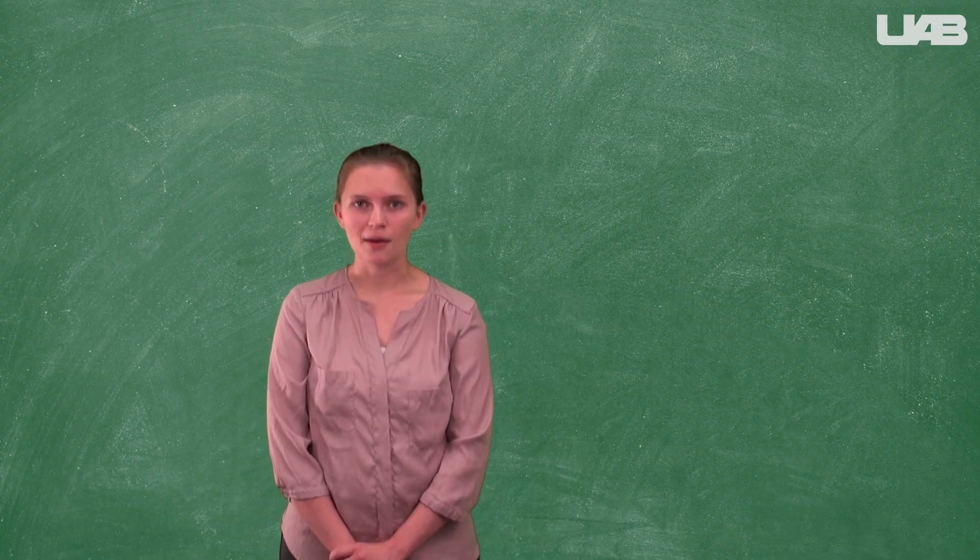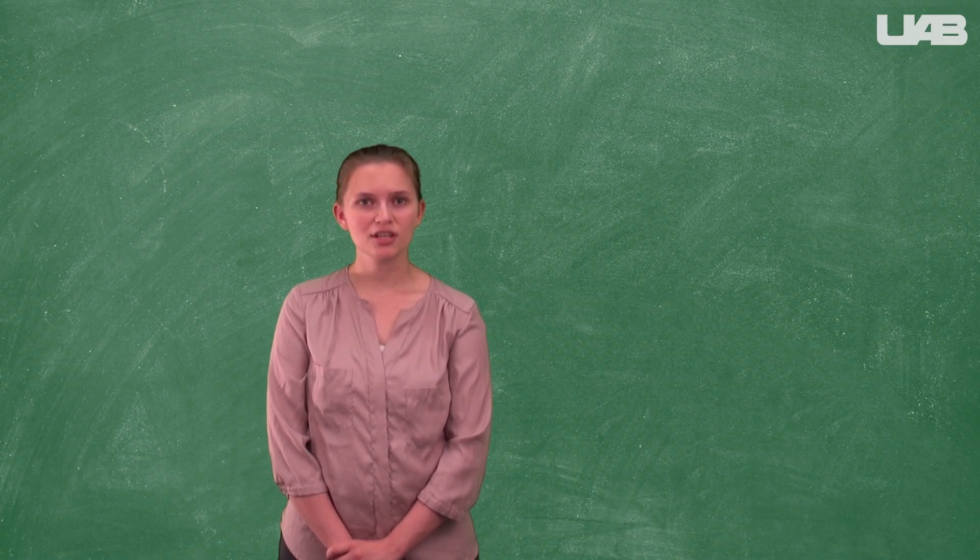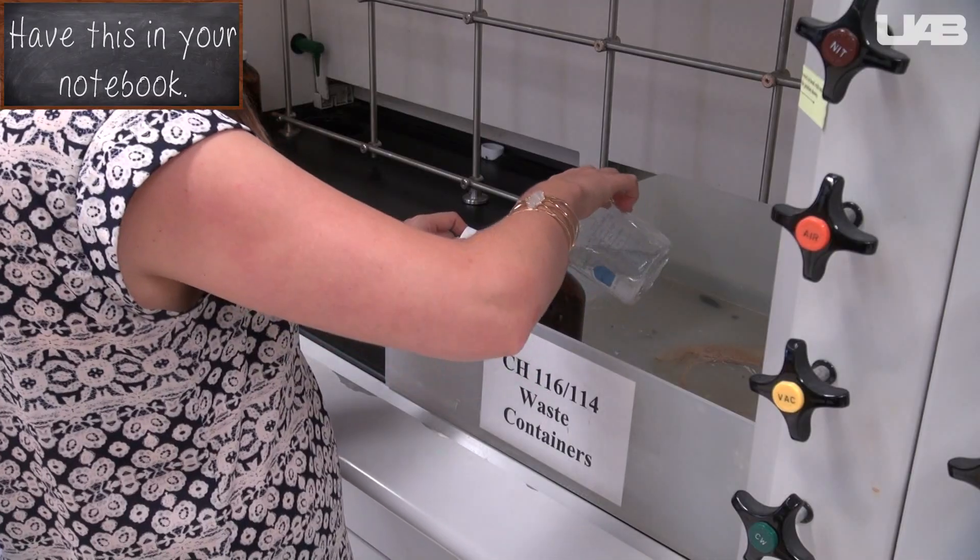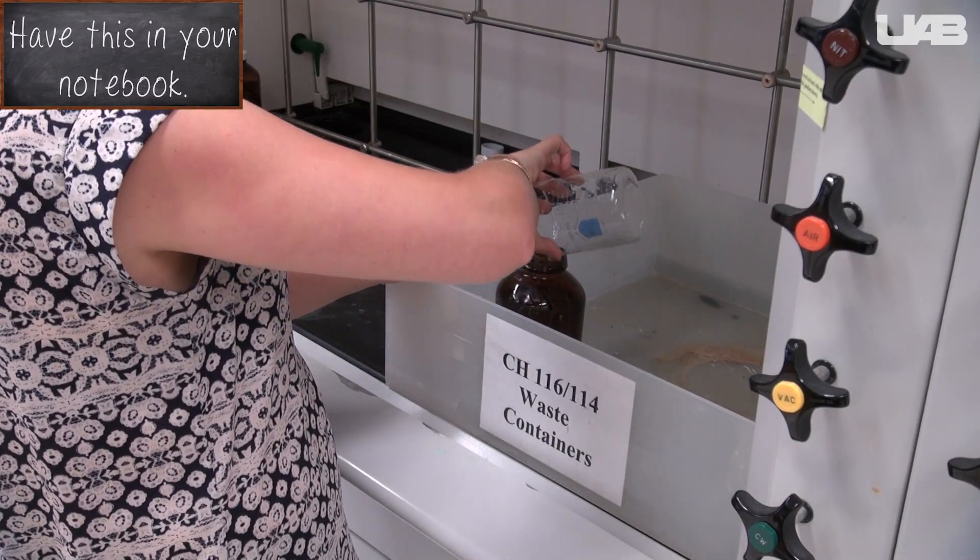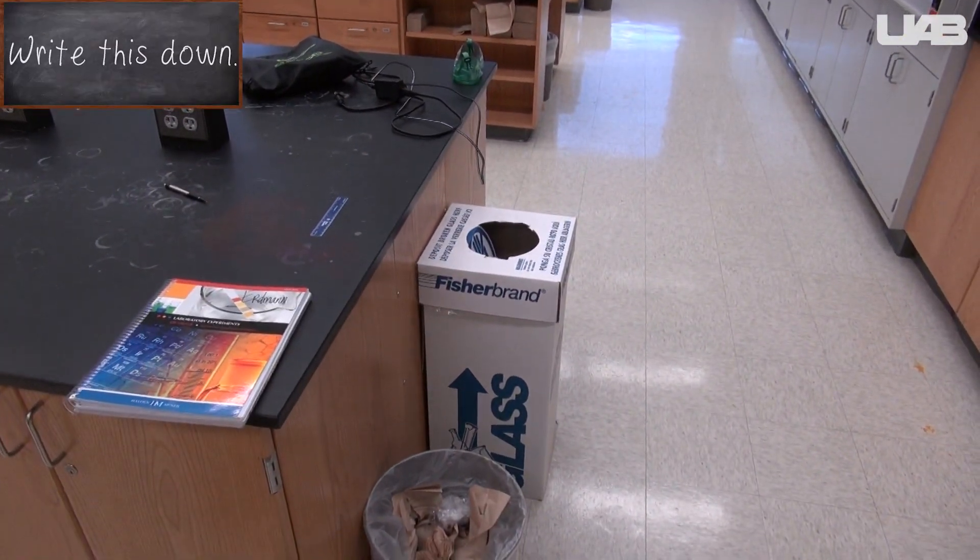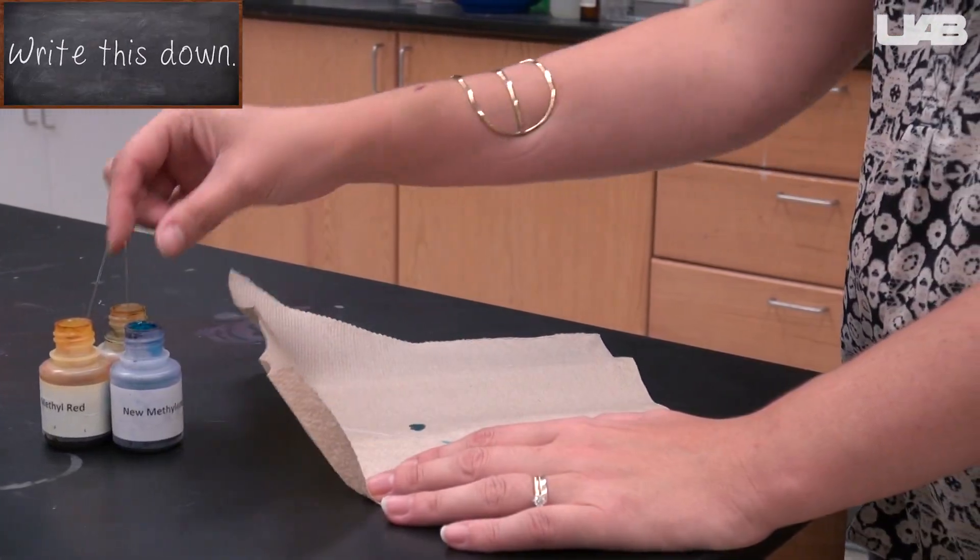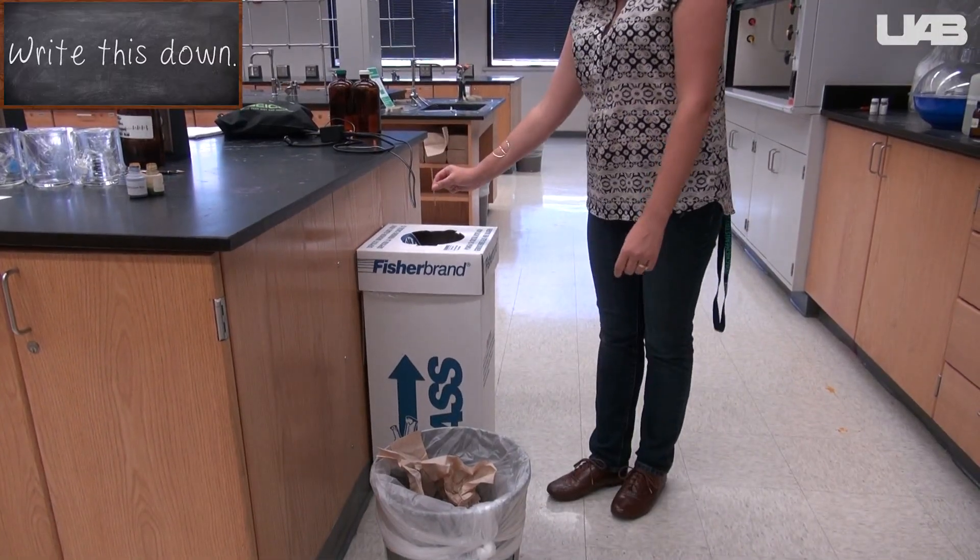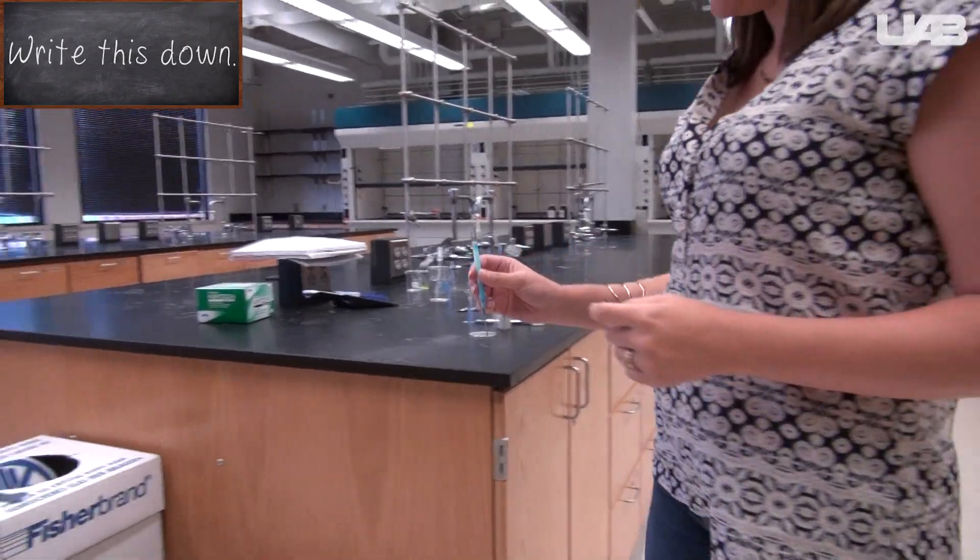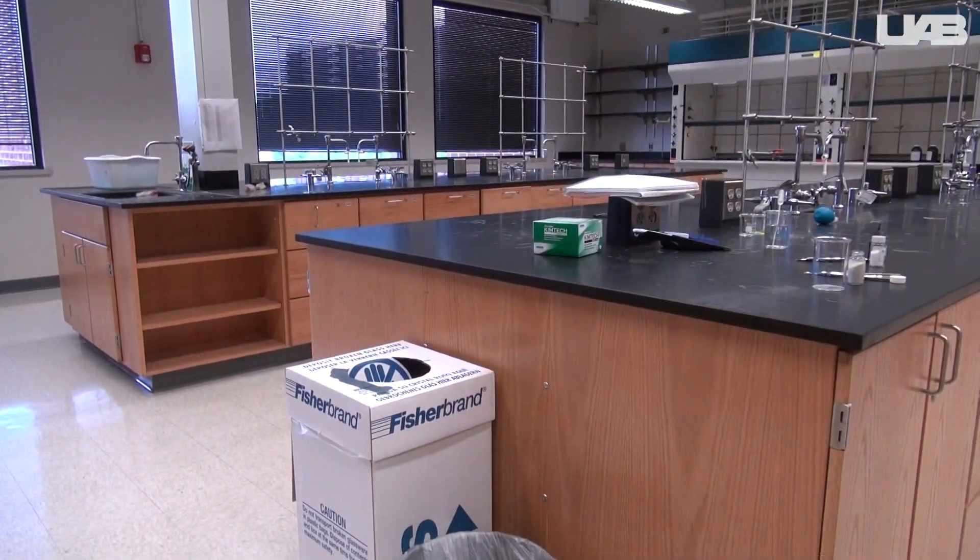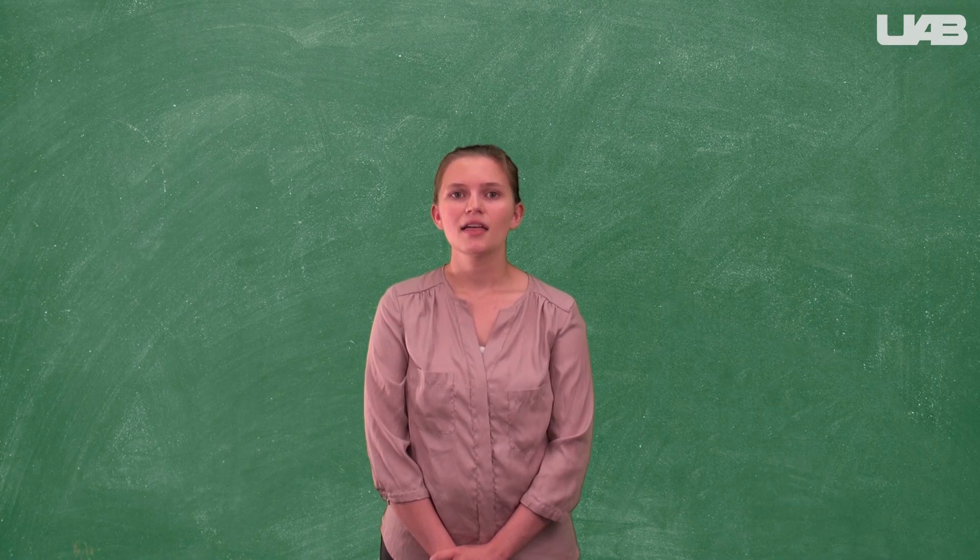When you are finished with the lab and are ready to clean up, make sure that you throw everything away in the right places. The solvents used today need to be poured into the waste containers located in the fume hood. Solid waste, like the TLC plates, can be thrown away in the regular trash can. To dispose of the capillary tubes, blot out the excess dye onto a paper towel, then throw them away in the glass disposal. The micro columns should be placed in the glass disposal. You don't need to clean everything out of the inside, just throw it away. That's all for this week's technique video and I will see you all next week.